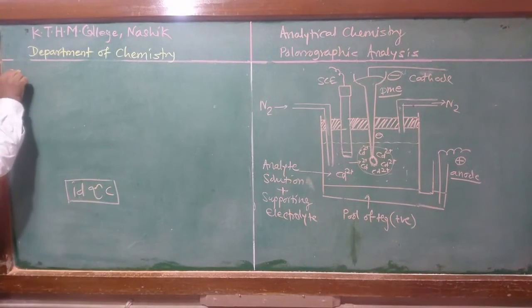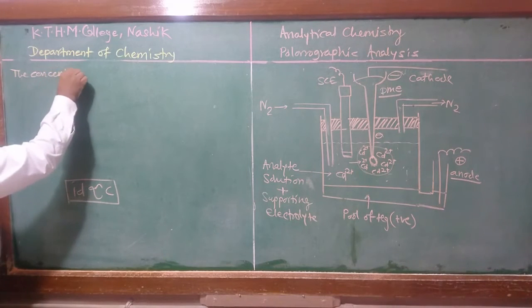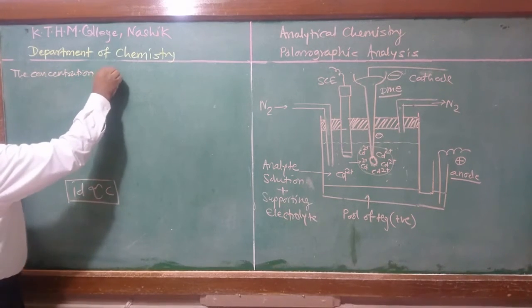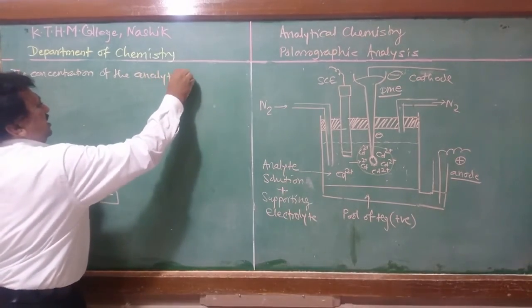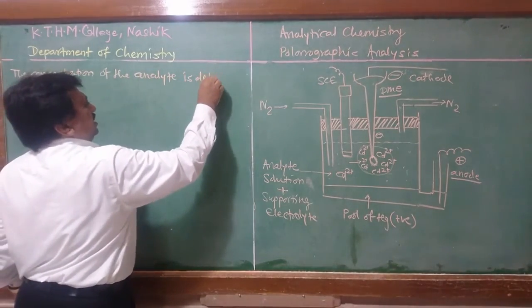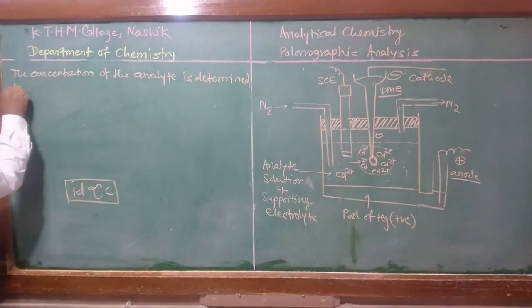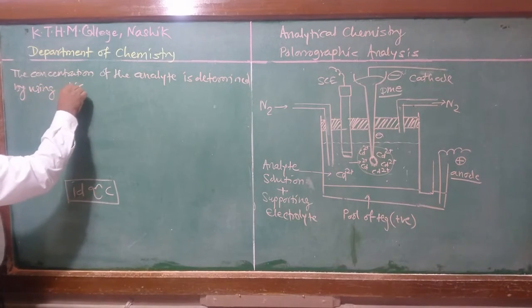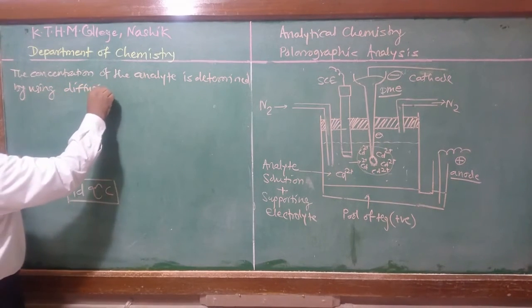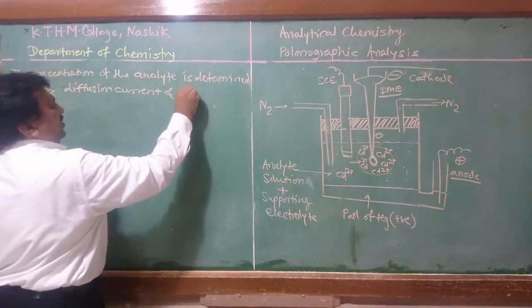The concentration of the analyte is determined by using diffusion current and Ilkovic equation.